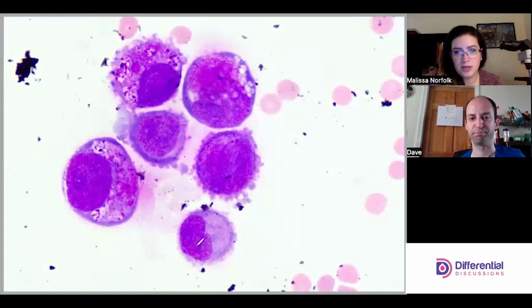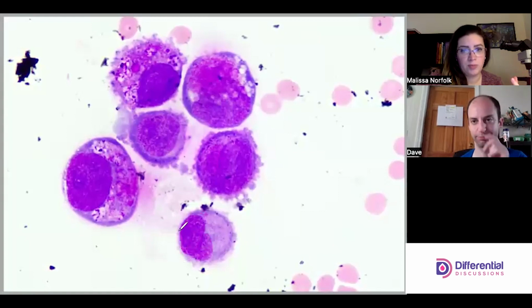Well, it has the lumpy bumpy exterior. It looks like it has two lobes here. It looks like it's got this weird giant nucleoli that's making an odd shape. And when a nucleoli is not round and making an odd shape, that's usually more of a malignant nucleoli, because if it's a normal cell with a normal nucleoli, it'll be a nice round nucleoli. It's making a shape like this guy here, almost like a not quite mushroom, a little bit blue out over here and a little bit thinner on the bottom. The fact that it's not round also lends to it probably being a malignant cell.